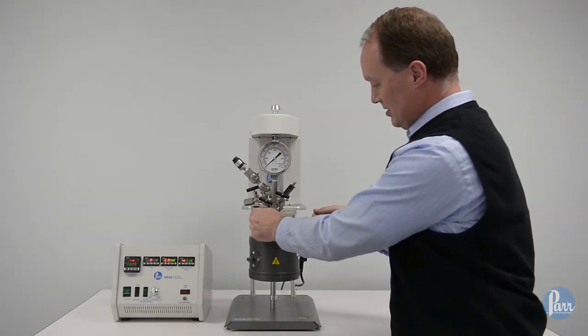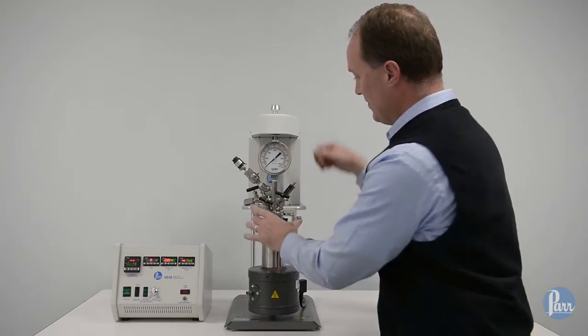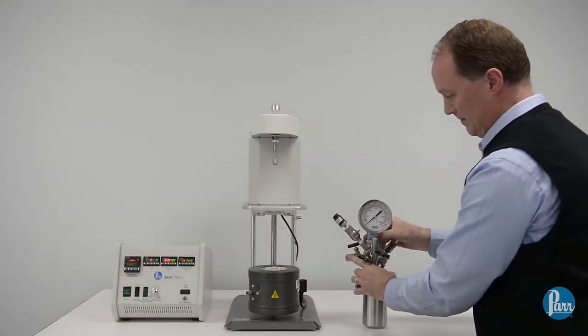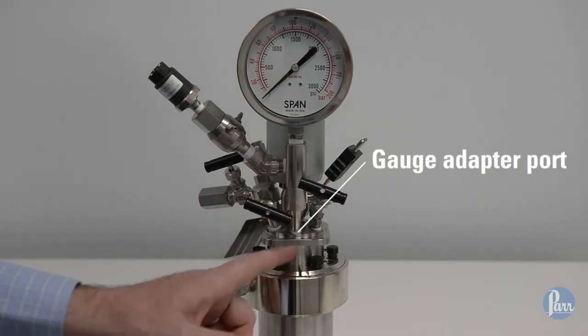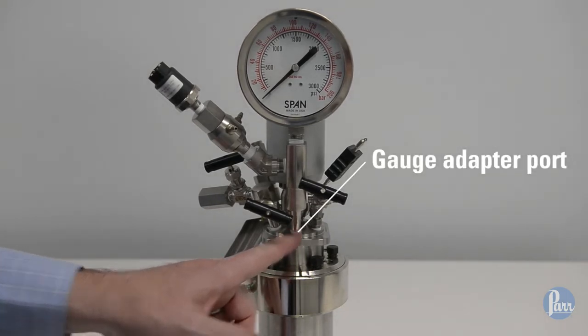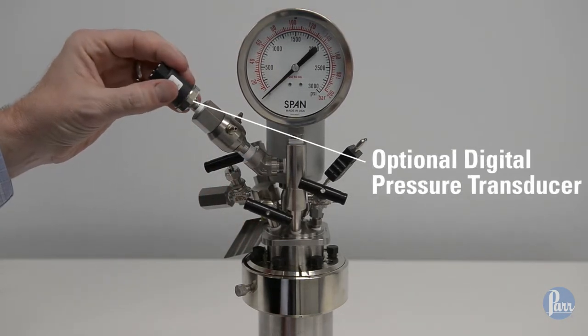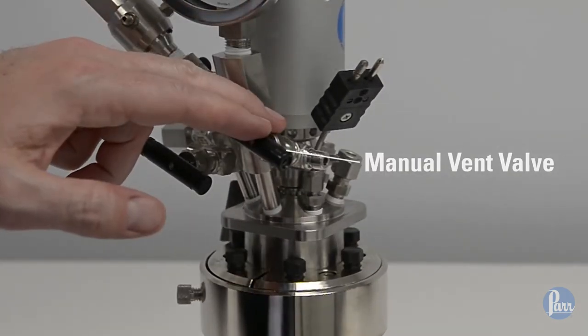I'll remove the vessel assembly so you can see it out of the stand. We'll drop the heater. We'll describe the standard head fittings in a Parr reactor, starting in the front with the gauge adapter port. The gauge adapter includes the analog pressure gauge, an optional digital pressure transducer, and the manual vent valve shown at the right.